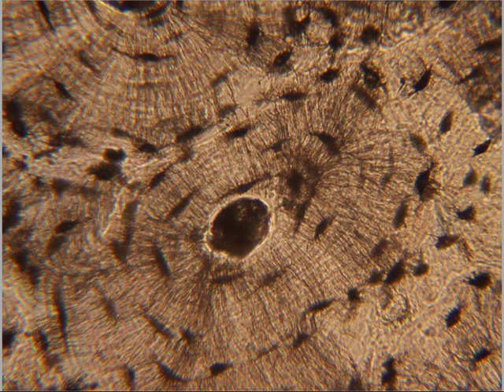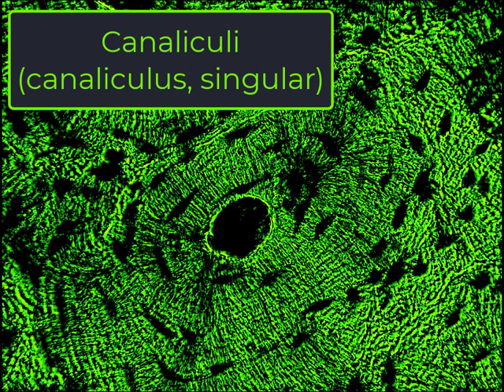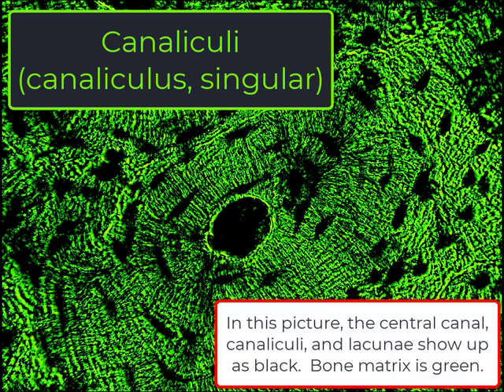Now let's look at one last feature, and that's these hairline cracks that appear to be a network connection between all the lacunae and the central canal. And indeed, these are exactly what they are. These are what are called canaliculi, or canaliculus, singular, which means little canal.